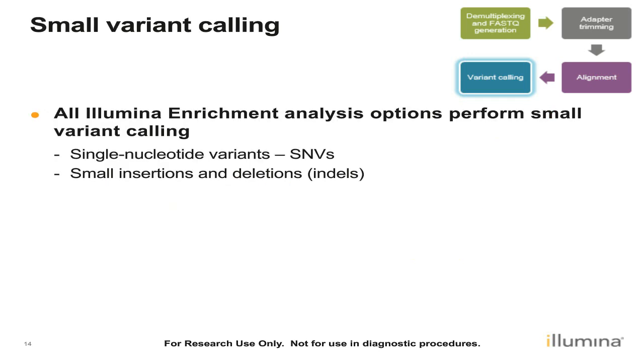Okay, so we're going to go through the different types of analyses within each of these, starting with small variant calling. So all of our enrichment analysis options can perform small variant calling. That's SNVs, or single nucleotide variants, and indels, or small insertions and deletions.